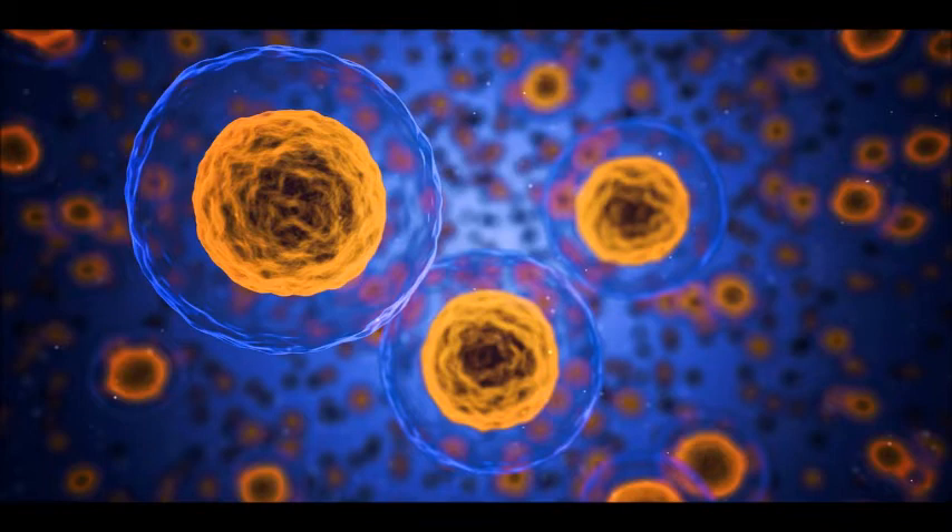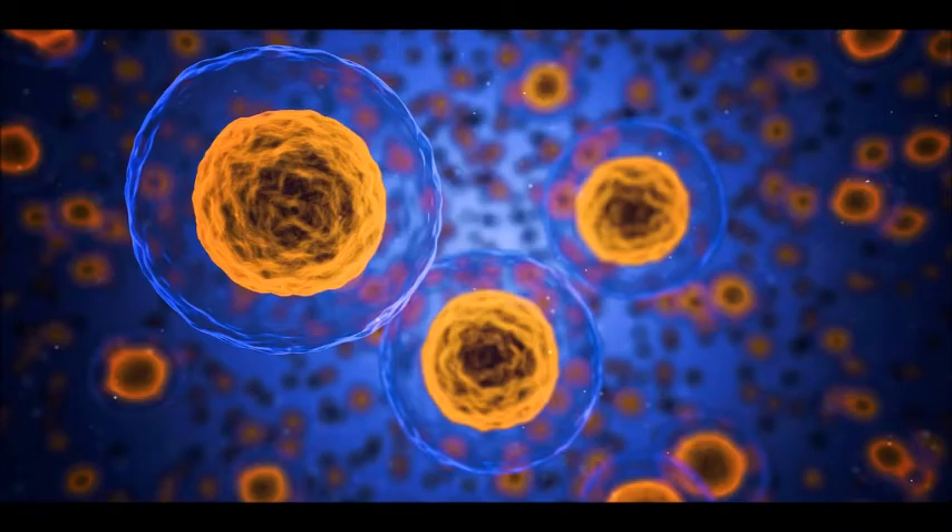Here you can see a solution of RNA which has been stained with hematoxylin stain. Notice the similarity between the RNA solution stained by hematoxylin versus the RNA stained by SYBR1 pictured here.